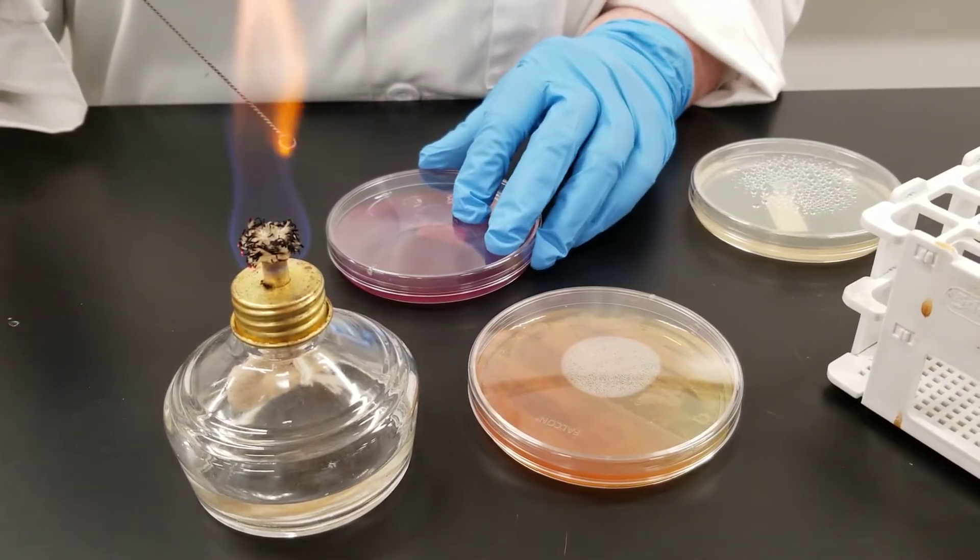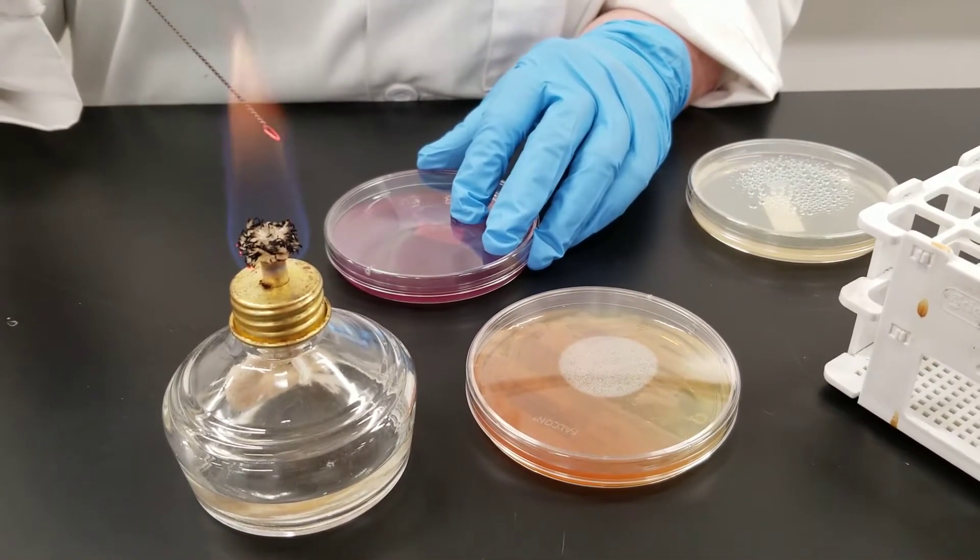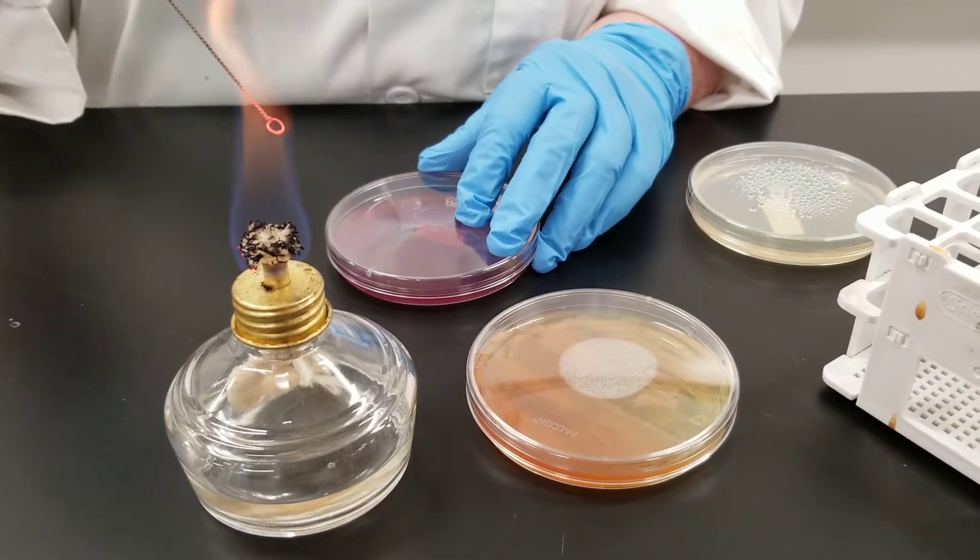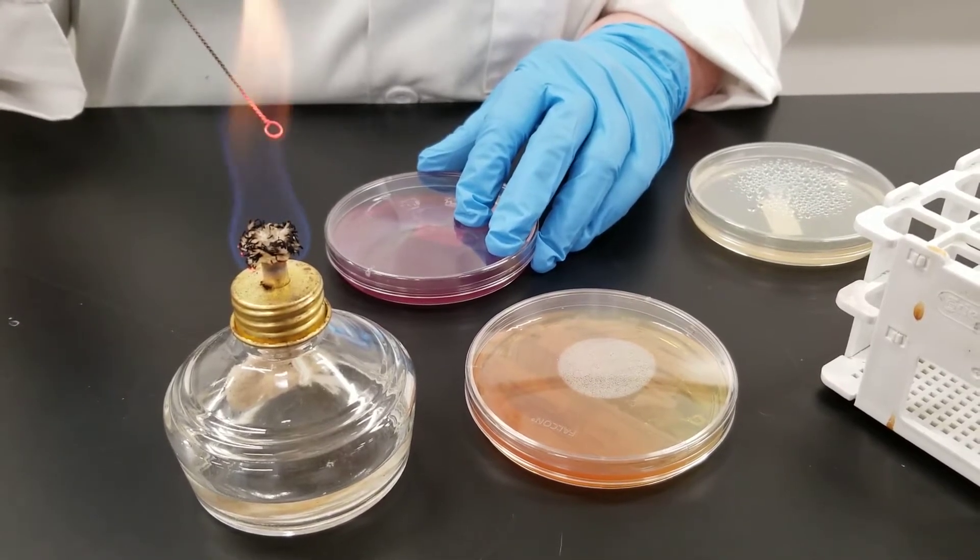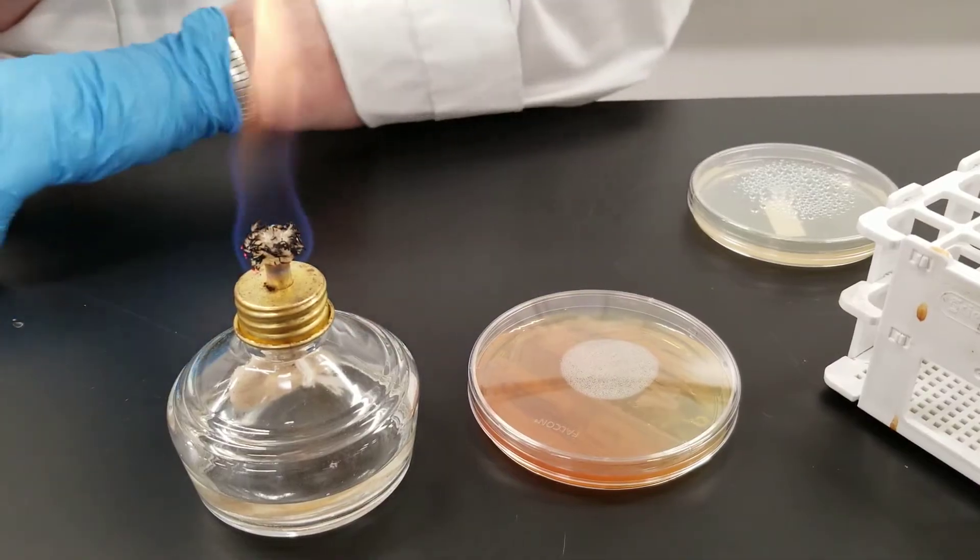When you're done, you need to flame your loop again. You still have bacteria on there so you need to sterilize it. Get it nice and glowing. This plate is done now.